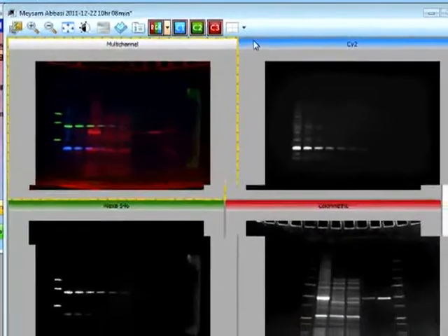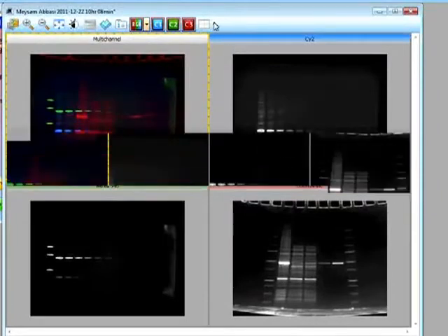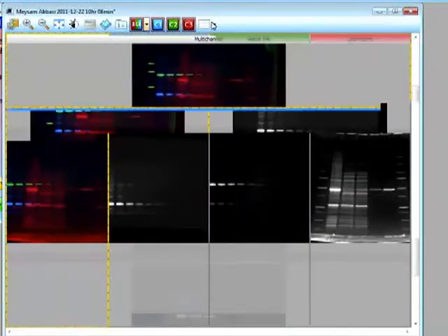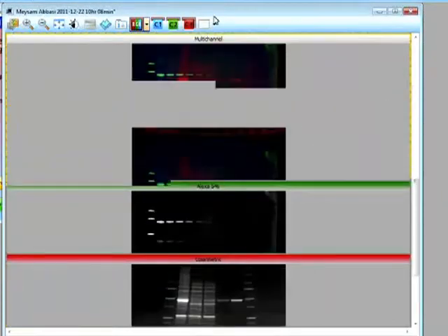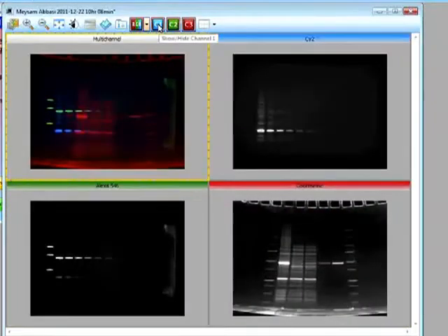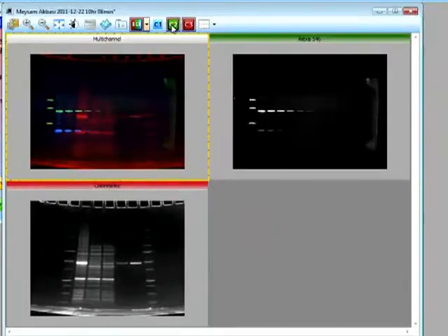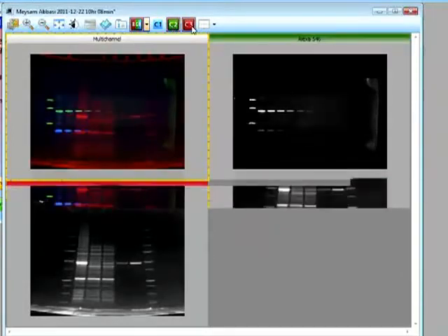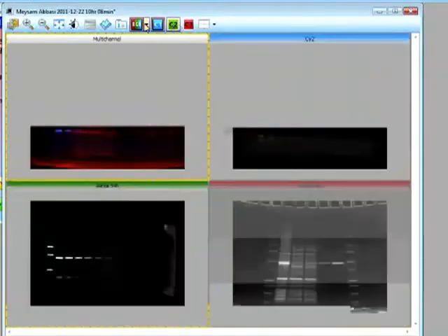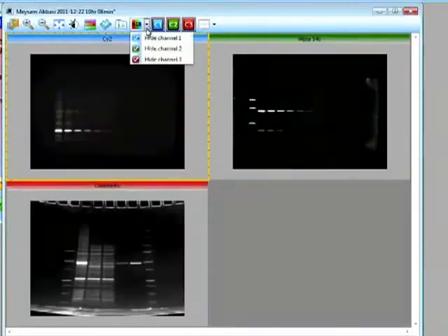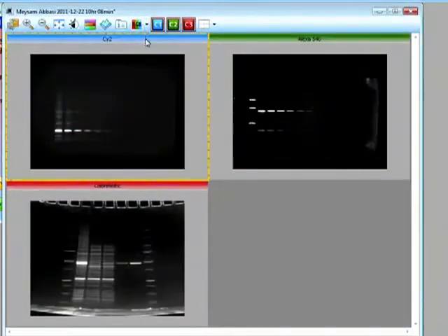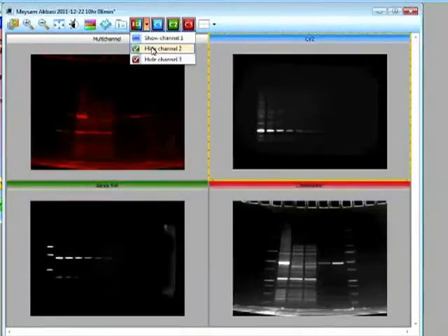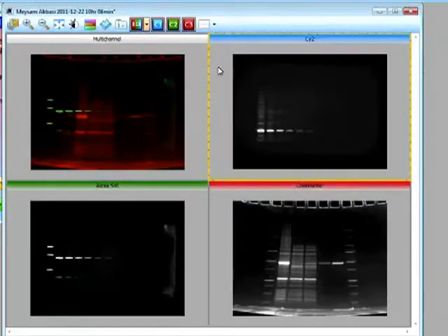And we can select to look at the grid view, vertical view, horizontal view, or single view. And in the full image, we can select to hide a specific channel if we wanted to. And in the multi-channel image, I can select to hide either of the channels to look at one or two specific channels.